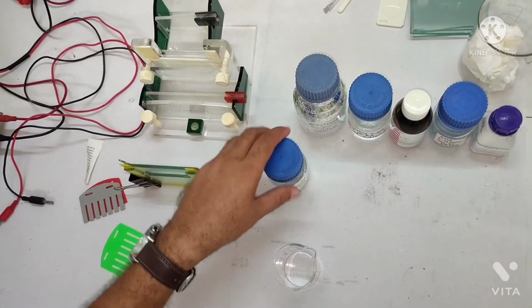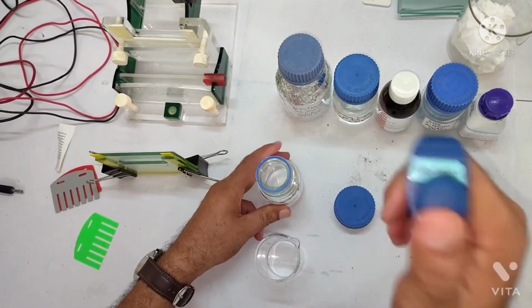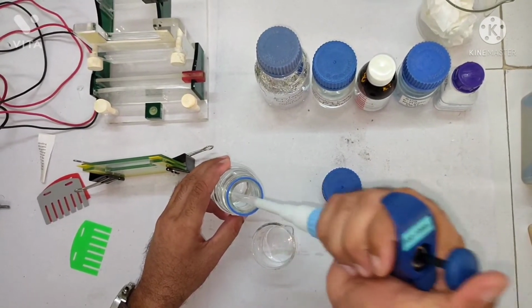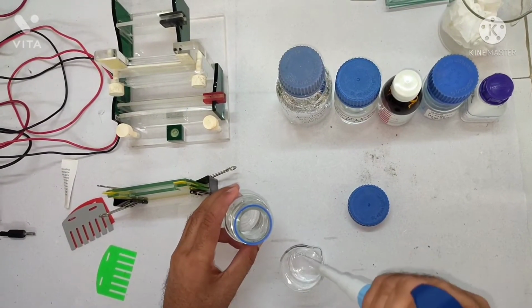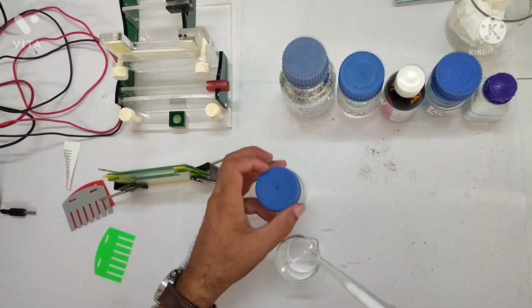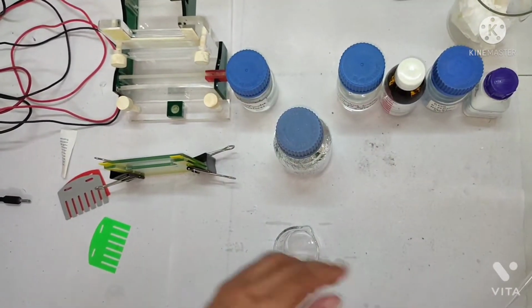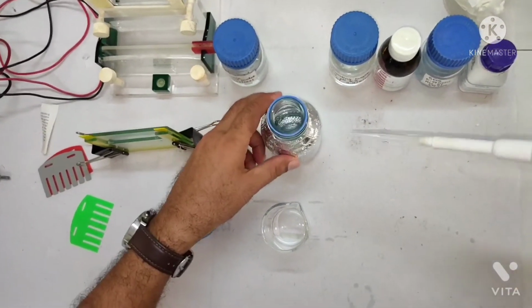So for separating gel, we have to take distilled water first. This is 4 ml. For 10 ml gel, we are preparing 10 ml of the separating gel, right? So we are taking 4 ml of distilled water. So this is our distilled water. Then we have to put 30% bis-acrylamide and acrylamide solution, which is 3.33 ml, right? We are making 10% acrylamide gel, all right? So for 10%, this table is there, what we have seen earlier, right? So now we have to put 3.3.